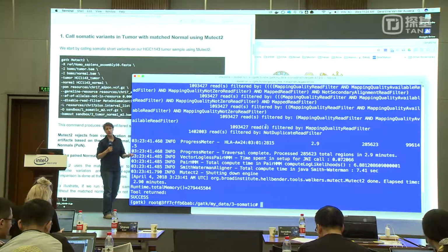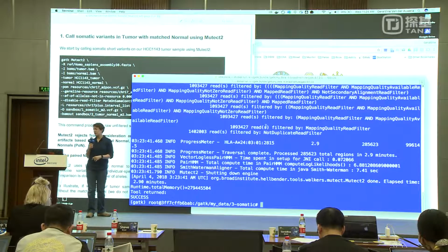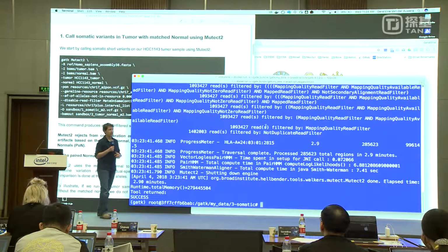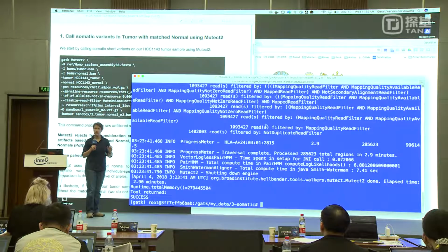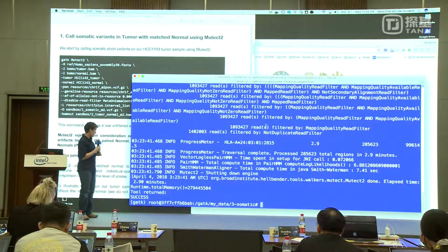There will be some things that look like germline, but you shouldn't use them as germline calls. I think they've had some plans to allow emitting things that are dismissed as germline, but it will come with some strong caveats about what you should or should not do with it. Okay?